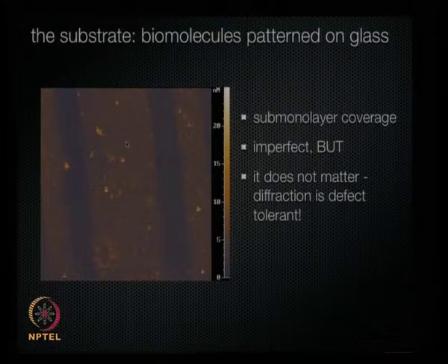Right. But as far as light is concerned, it doesn't matter because these clumps are non-repeating. If they're not periodic, it doesn't show up as a signal, and so it ignores all this. You see, this is probably a protein, or maybe this is a piece of junk, and it ignores that completely. So I think some error can be tolerated in that way, the diffraction.